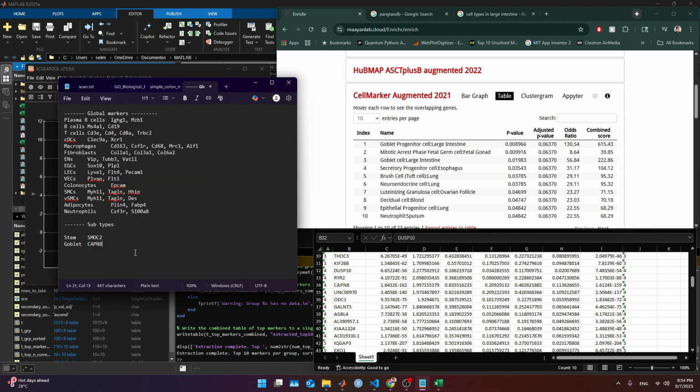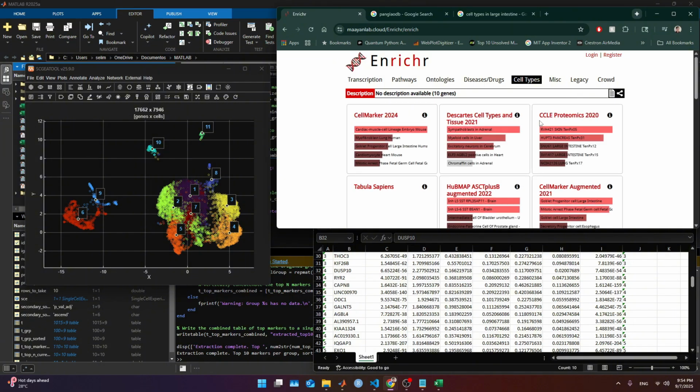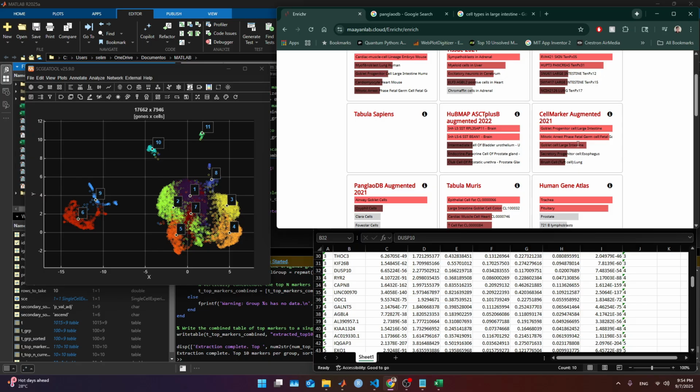So what I'm gonna do, for example, this is part of what you can look here that simplifies things a little bit, but there is another way. So this way it's complicated because you have a lot. It's easier if all of them convey the same similar cell type, but if not, we can do something simpler than this.